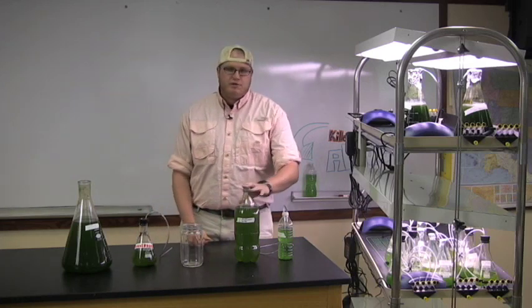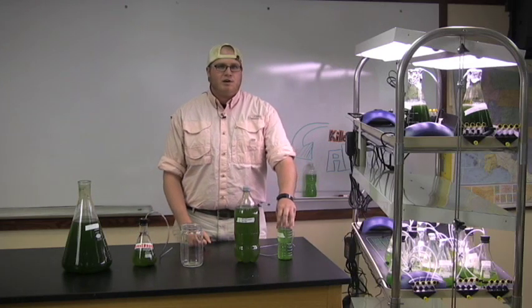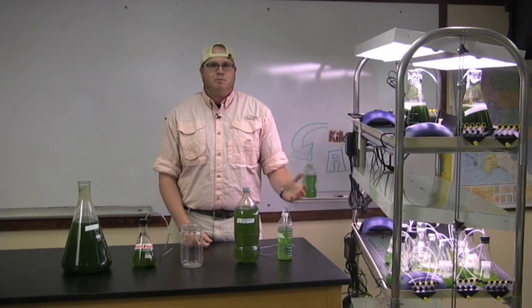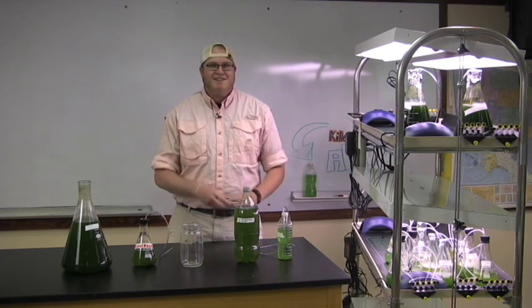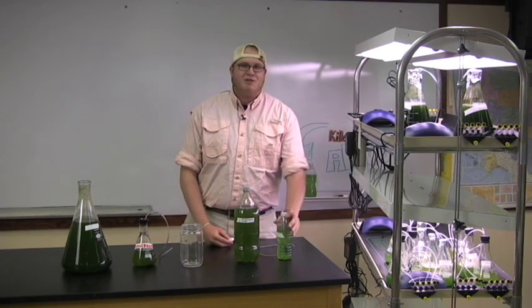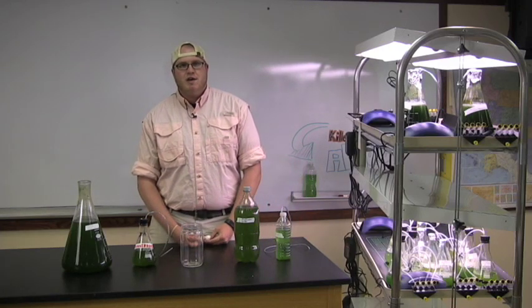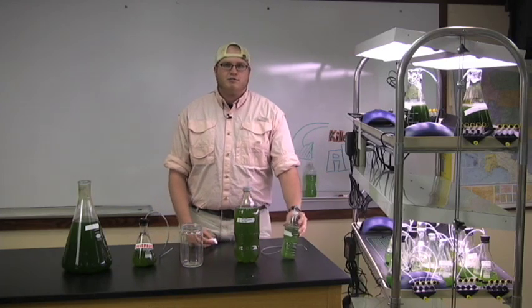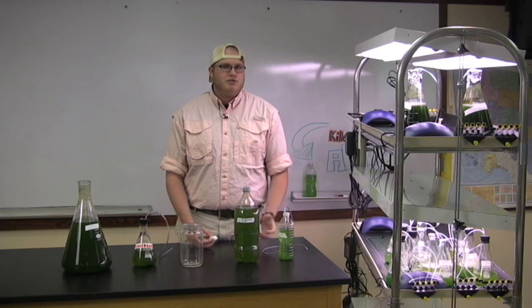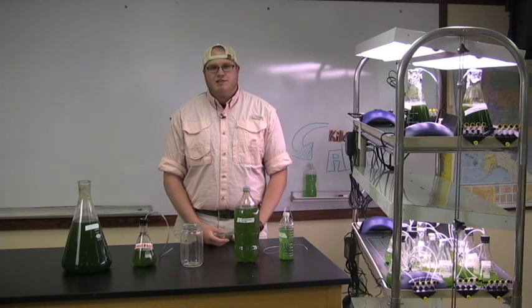We tested 2 liter clear plastic soda bottles and 16.9 ounce clear plastic water bottles for classroom setups. We found both bottle types to be cheap and effective growth containers. We put 2 holes in the caps to run airline in and vent out excess air. The 2 liter soda bottles worked well for growing large cultures but were difficult for very dense cultures. The small water bottles grew dense cultures but at a much smaller volume. Which container is right for your classroom is up to you to decide.